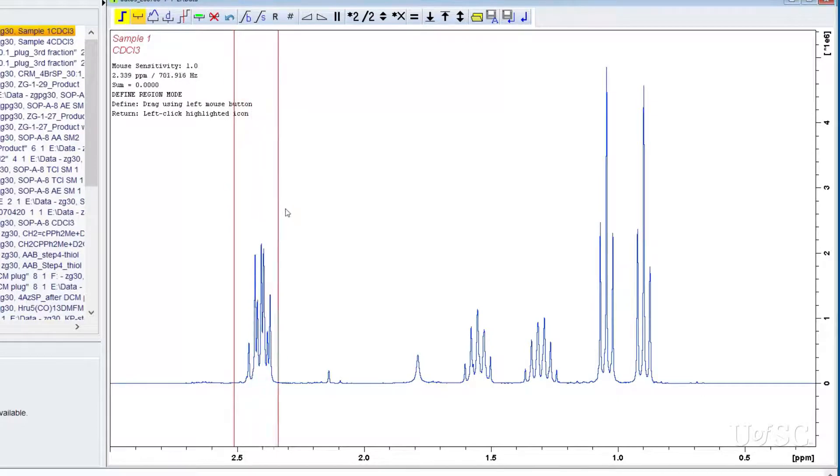Then move the cursor to the other side of the peak. Release the mouse button and the region should be created. This works in either direction. Repeat these steps for every region you want to integrate.